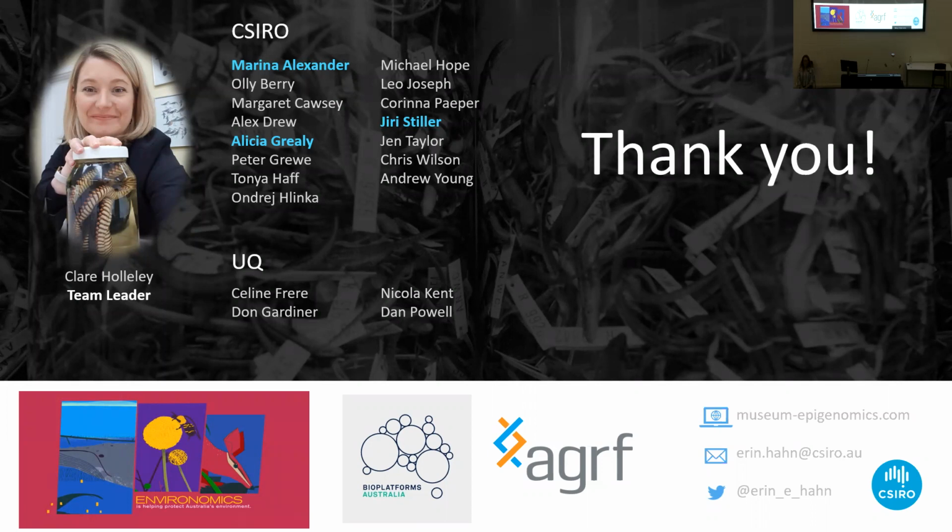So great stuff. I've got one short question, one longer one. ATAC-seq, how is that connected in this context? Why have you used FAIRE as the foundation and not ATAC-seq?